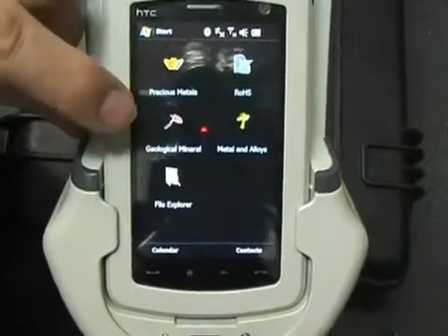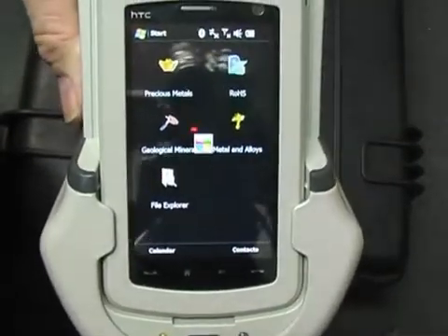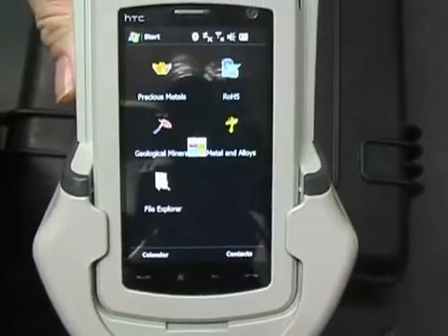We select the metals and alloys program. Loading takes around 30 seconds to load the first time.